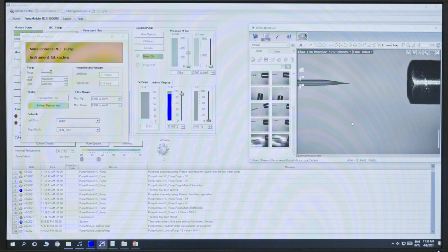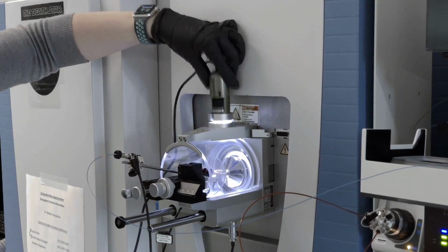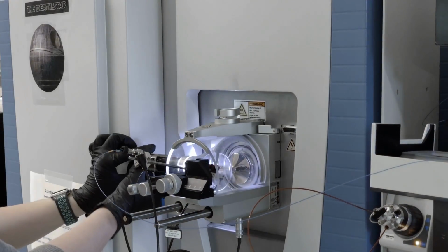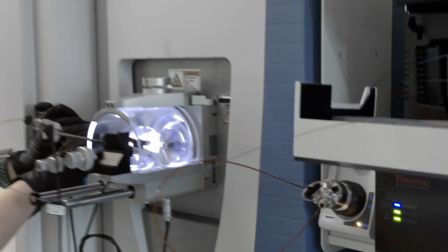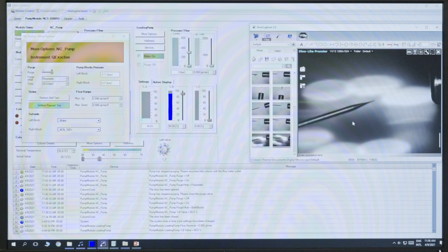You can then move the camera to the side so that we can adjust the top and bottom position. So here we can see that it is a little bit low.